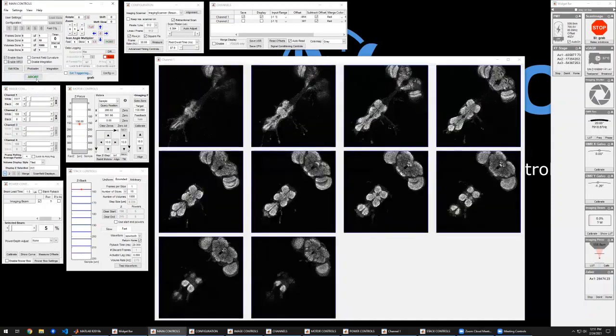So now, even though my frame rate is 30 Hertz, since I'm decimating that by how many slices I'm imaging, I'm only getting a volume rate of 2.73 Hertz, which is not great. So if I'm looking at a sample like this, and I'm only interested in very small regions that are distributed amongst the area, then it's much more effective for me to only focus my scanning on those regions, and that way increase my frame rate.